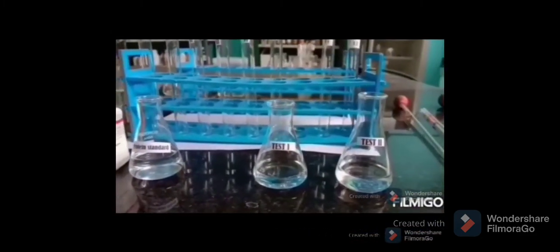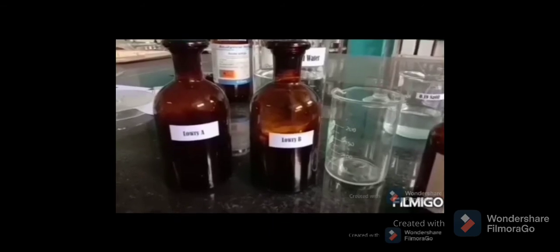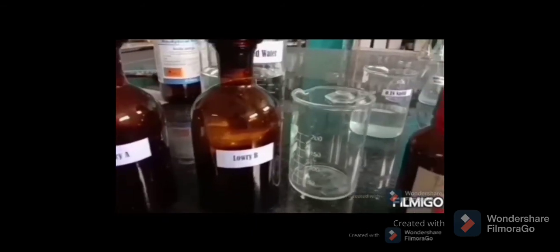The test solutions, the concentrations of which are to be found out, are used. Then Lowry A: sodium carbonate in 0.1 normal NaOH. Lowry B: copper sulfate in sodium potassium tartrate.